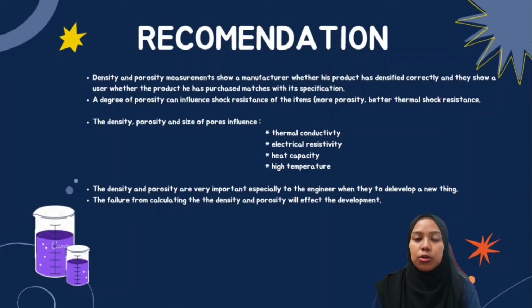First, density and porosity measurements show a manufacturer whether their product has densified correctly, and they show a user whether the product they have purchased matches its specification. Second, the degree of porosity can influence the shock resistance of the item. It is because the more porosity, the better the thermal shock resistance.